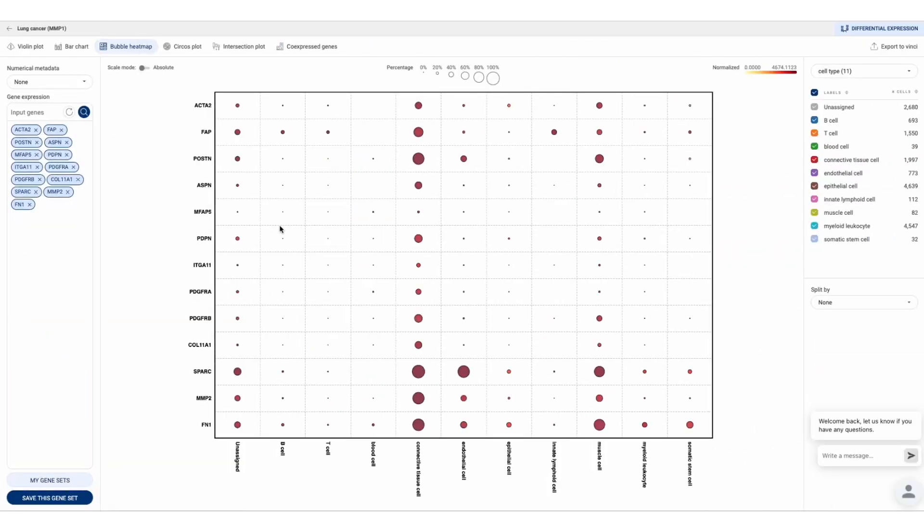Not only the expression, you can quickly look at the enrichment of these genes by just one click. Again, we can see that this CAF gene set is highly enriched in the specific group of connective tissue cells in our custom lung cancer atlas.